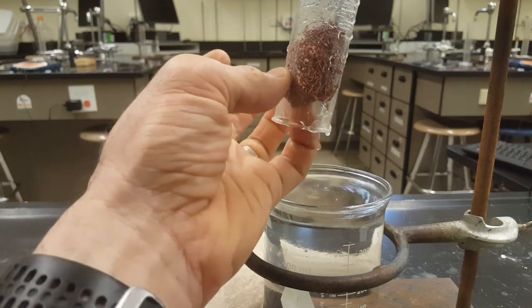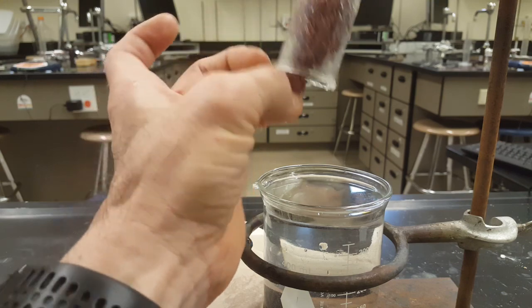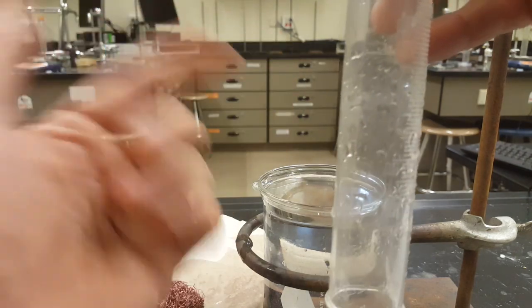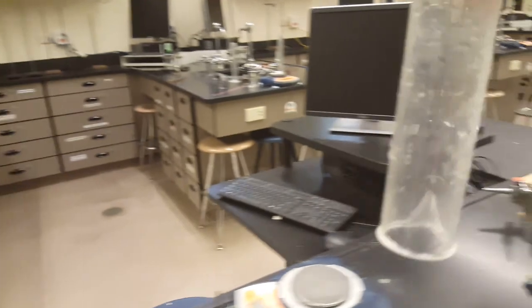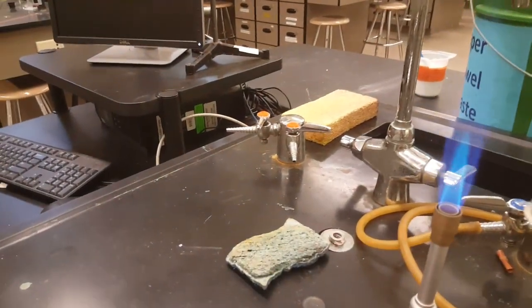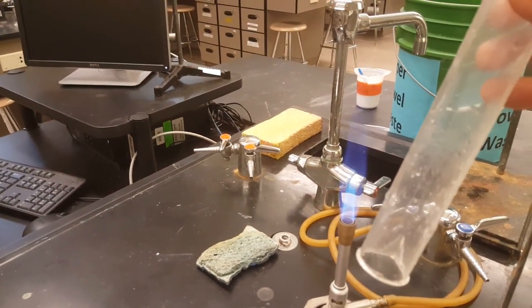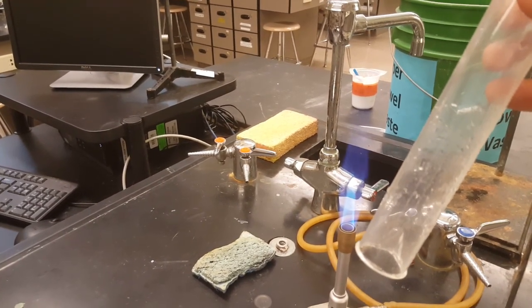Hydrogen is less dense than air, and so you want to make sure that your graduated cylinder stays upside down. If your graduated cylinder goes right side up, all your hydrogen will escape into the atmosphere. Bring your graduated cylinder over to your Bunsen burner and put your hand over your heart. Repeat after me. I promise I won't hold the plastic graduated cylinder in the flame.